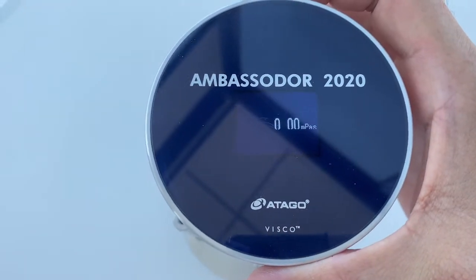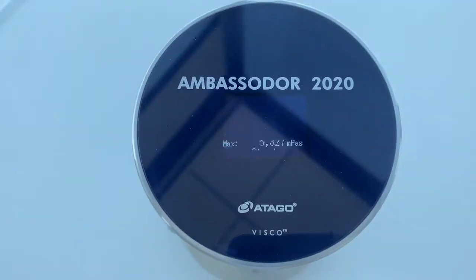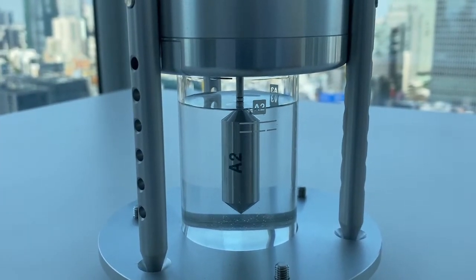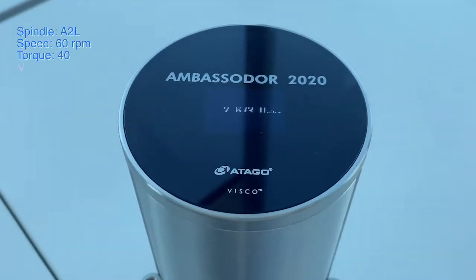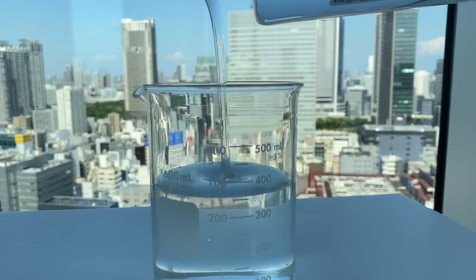Okay, and we already have set up an A2L spindle. RPM is 60. We press start, it starts spinning, starts measuring resistance, and it turns that into viscosity. So the A2L spindle at 60 RPM creates a torque of 40, and this sample has a viscosity of 2,673 mPas. And the model that we've seen so far is the Visco. From this point on is the Visco BL.